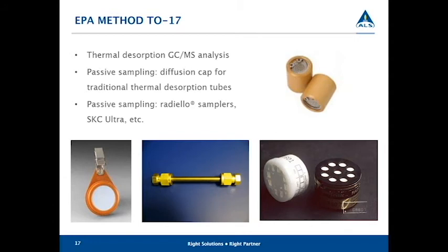It also depends on the time of the year, and I think most of the listeners will have experienced situations where they've called the lab and they don't have any. Even with 4,000 canisters at our laboratory, we can still run into a pinch. That seems to coincide with very popular sampling times like winter and summer, when clients are doing their vapor intrusion investigations for indoor air, and they have to do a summer or winter. At that point every consultant in the country seems to decide to do their sampling at the same time. So labs can get into a pinch.